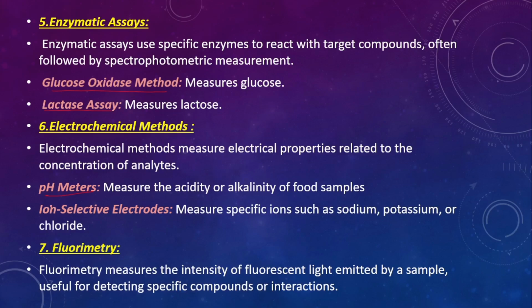They are used in processes such as fermentation, cheese production and beverage testing to maintain consistent pH levels. Accurate pH monitoring helps to prevent spoilage and ensures the stability of the preservatives. The meters are often used in both production and quality control stages, providing fast and reliable measurements. Maintaining the correct pH is crucial for regulatory compliance and consumer safety in food processing.